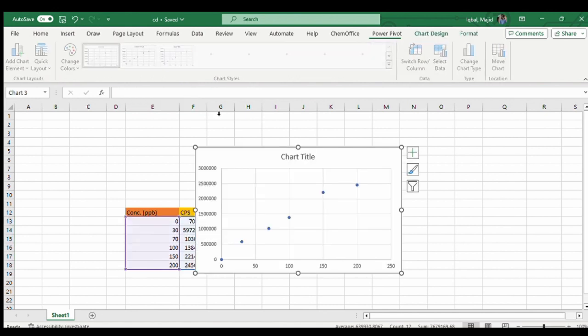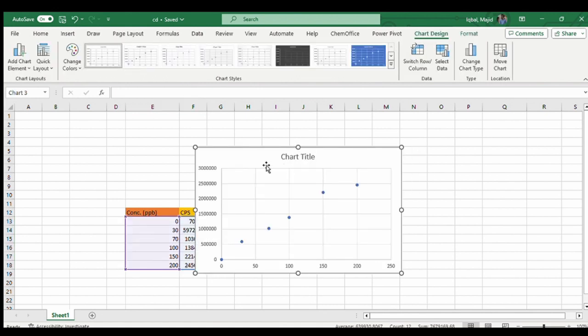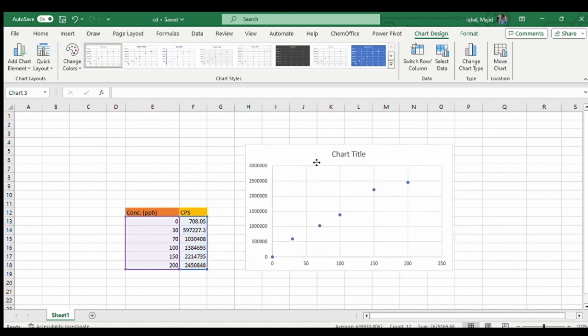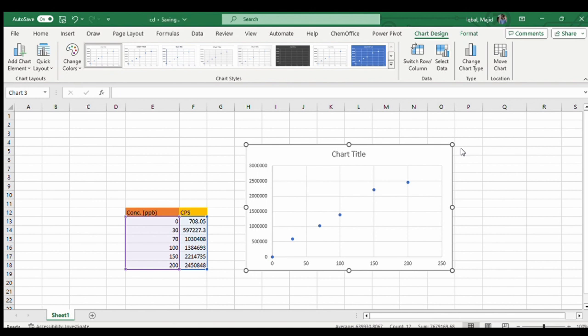The chart appears over here. Then you can see the plus sign here. You have to select here and then there is a trendline. You will click on the trendline and the trendline appears over here.